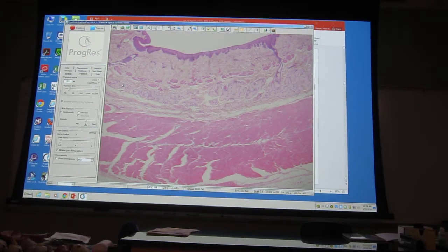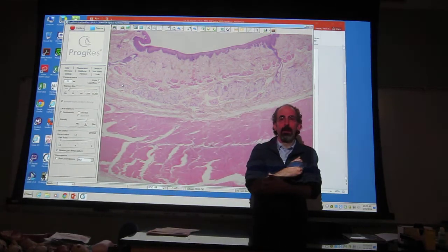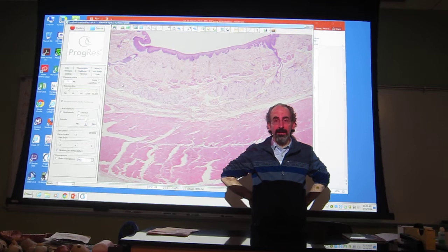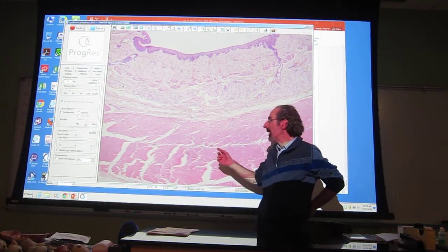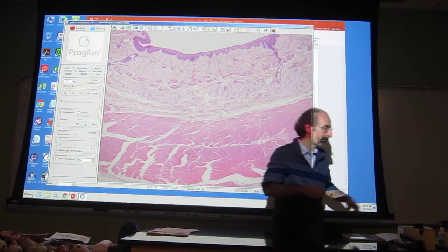Hello, this is Professor Nassar, and today we are going to talk about the histology of the gastrointestinal tract. For those of you who have not seen it, I put up a little whiteboard talk before making this presentation. For those who have it available, you should look at that first because it gives you a comparison, in cartoon form, of what we're going to be seeing here.